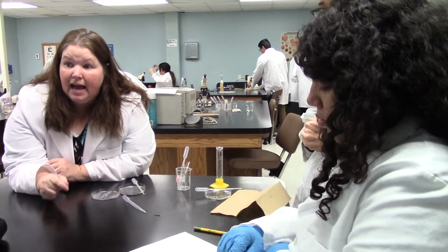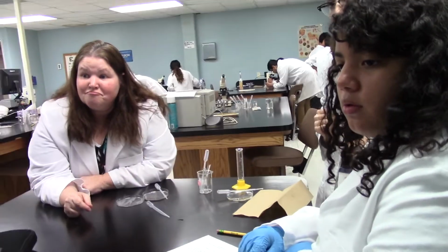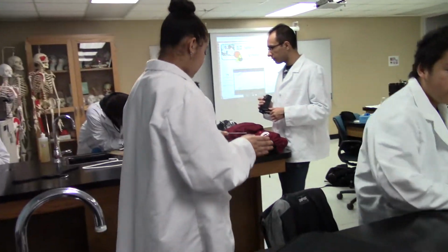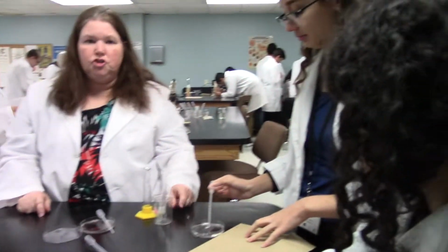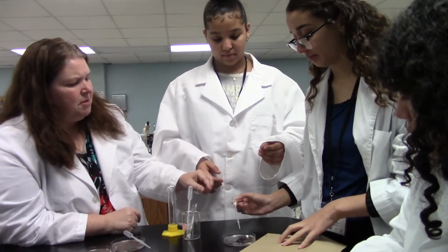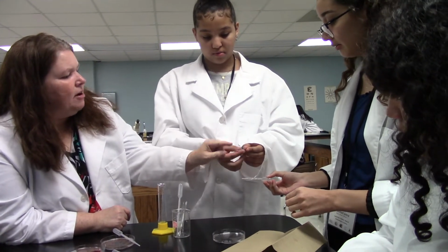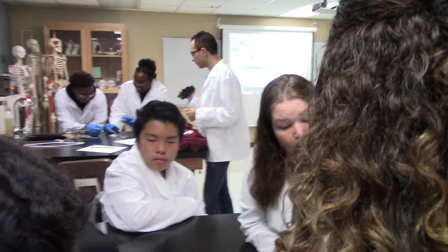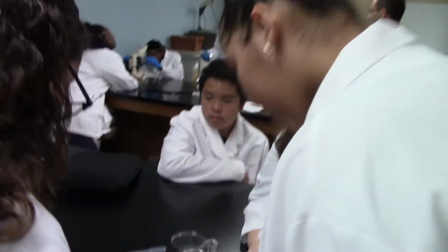Now you're going to take the little guy off the stage. Poor little guy. You're going to suck up some sugar water, because she's got 15 milliliters of sugar water in that petri dish, right? Okay. I'll just suck some up. You just want to flush him out. Since he's down on this end, I would just put the water in that end, and you're trying to flush him out into the water. Ooh, see, that was easy. Oh, there he is. Push right out.